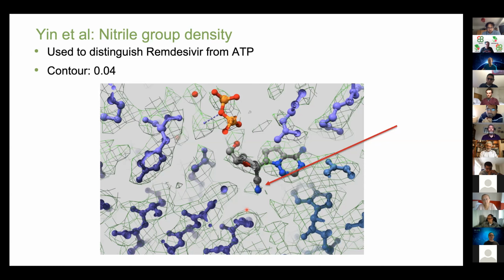Did you want to expand on your point for the moment, Elena, specifically? Specifically because typically the overall map and half maps, when you're doing something like high frequencies and fine details, are very often blurred, and you have the resolution map.